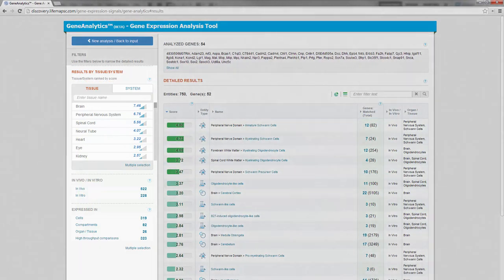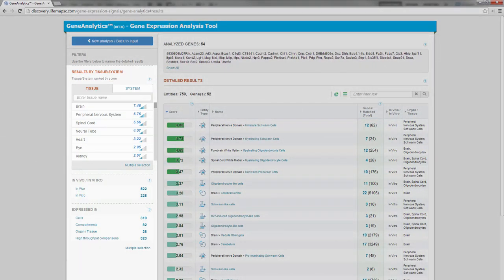On the left side is a powerful set of filters that helps you focus on the results that most interest you. The first filter is the tissue system filter. This also serves as a low-resolution result table and presents an integrated score for each tissue and system.